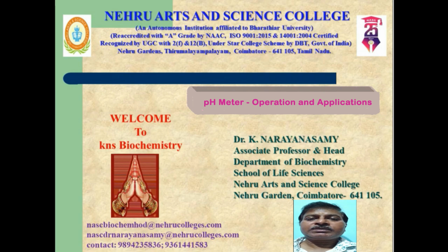For that purpose, there is the pH scale, which is available to find out the acidity or alkalinity of a solution. The pH scale is a numerical value where the concentration of proton is converted into a number, called the pH value.